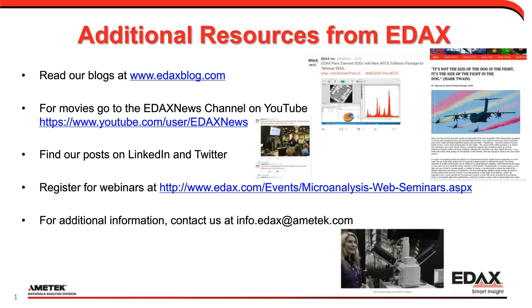Everything in analytical chemistry is signal to noise, no different with EDS detector technology. The more signal to noise you have, the better your mean detection limits and the better your quantitative analysis will be.